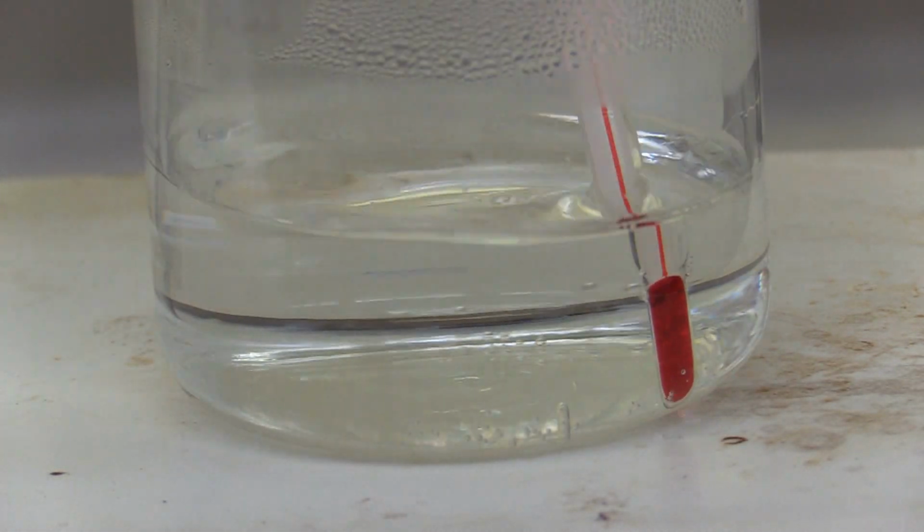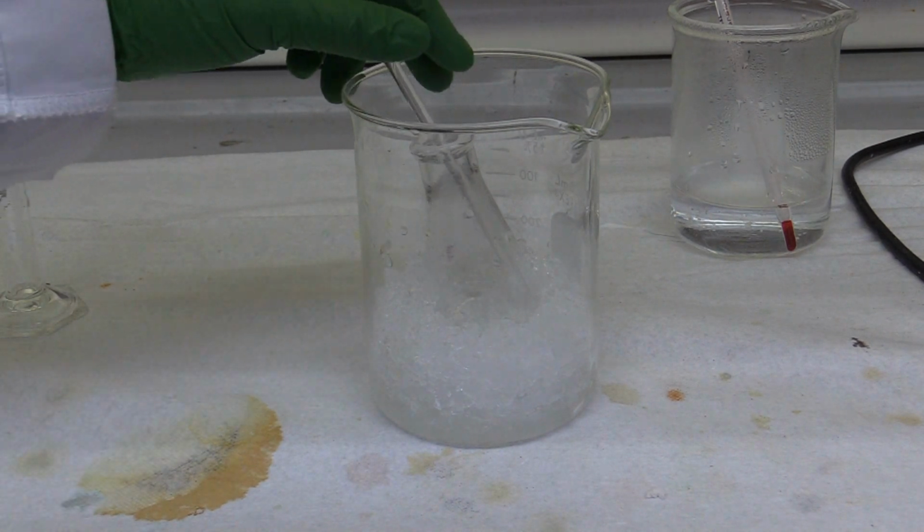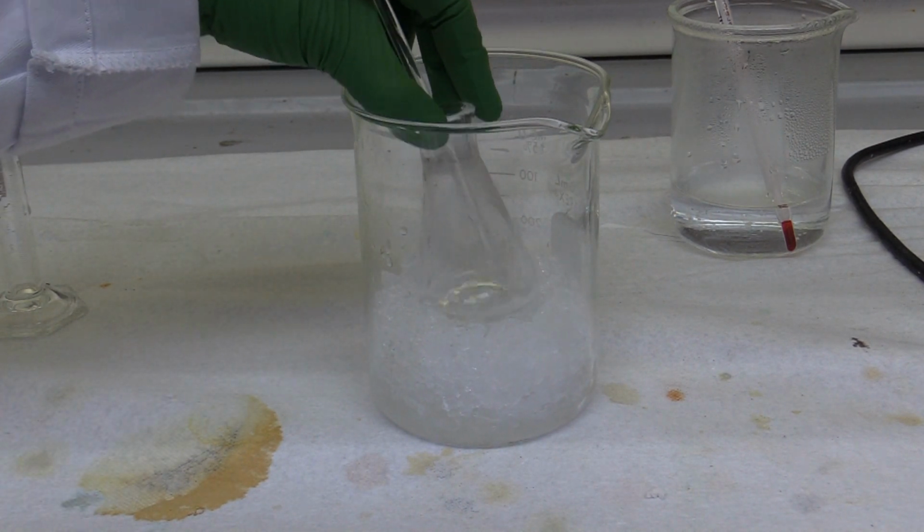You can keep the hot plate on and start warming some water and ethanol. Remove the flask from the water bath and add 1.5 mL of DI water to decompose the acetic anhydride. Wait for a few minutes for any reactions to occur and add 2 more mL of water. Cool the flask in an ice bath for several minutes.